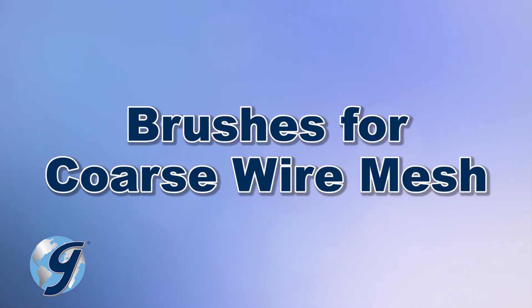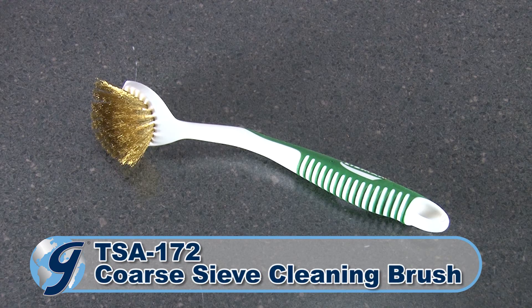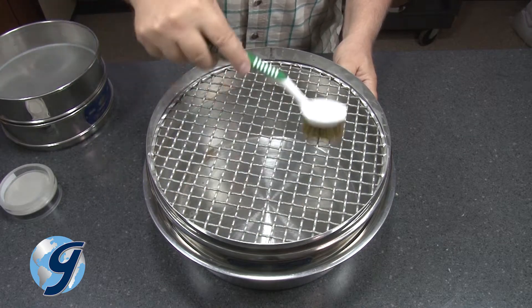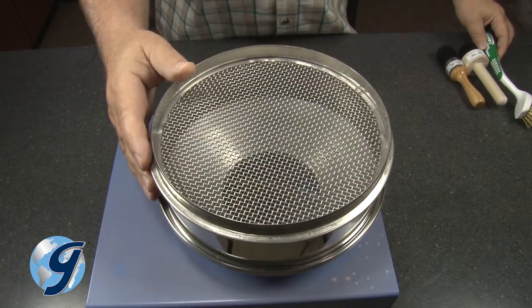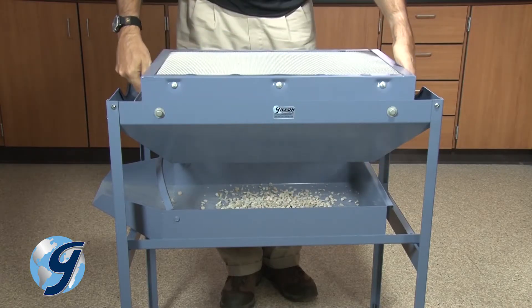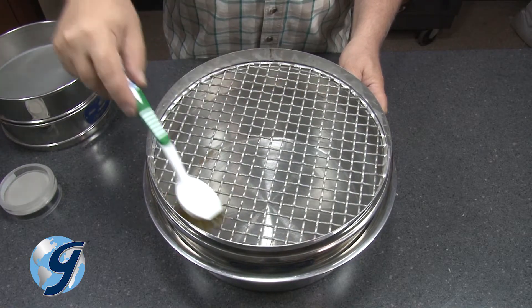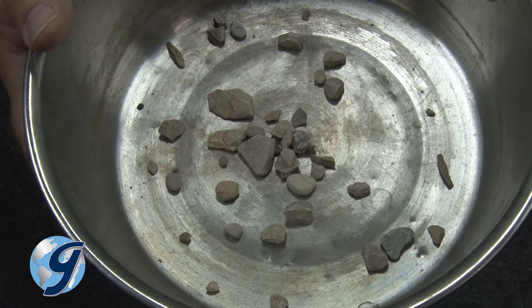The Gilson TSA-171 coarse screen tray brush and the TSA-172 coarse sieve cleaning brush are recommended for use with number 30 and coarser wire cloth. These rugged brushes have brass wire bristles that effectively move material through the mesh openings. The TSA-171 is especially designed for screen trays, whereas the TSA-172 can be used with both screen trays and test sieves with coarser wire cloth.